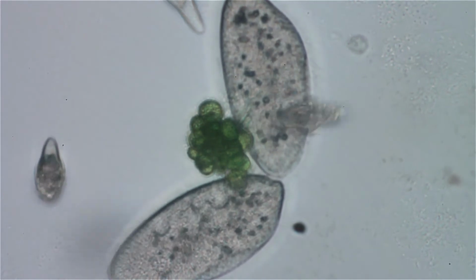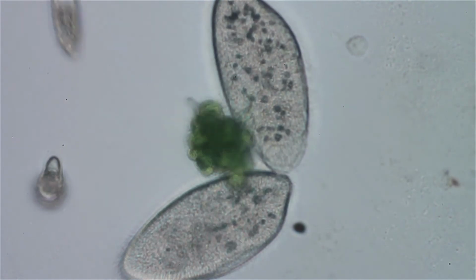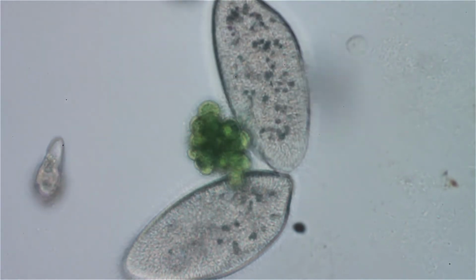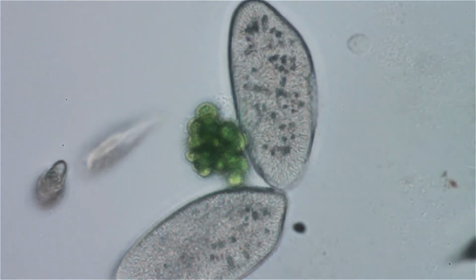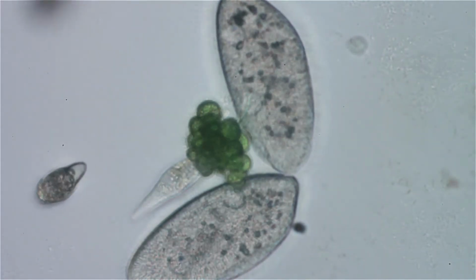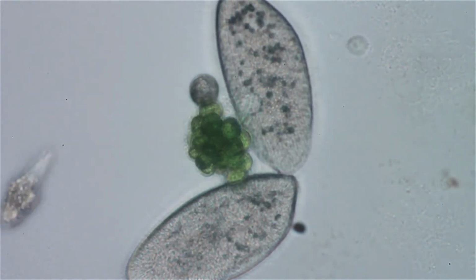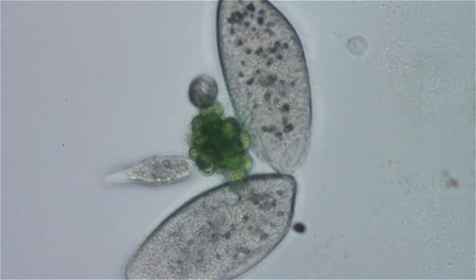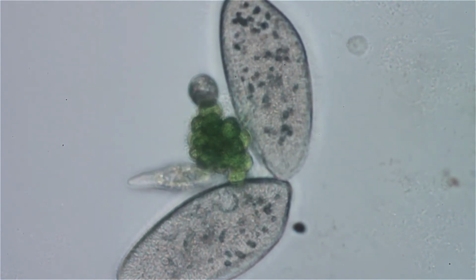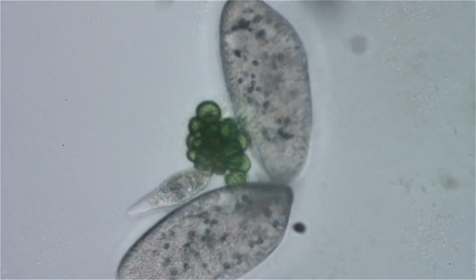And you can see a red eye spot, a hint of one in the Khawkinea to the left there. And this is just the main branch of the family. I don't know what the subspecies is called. And their flagellas are not very visible under this lighting. I guess I will have to try a phase next time, see if I can get some, maybe slow them down with Protoslo.